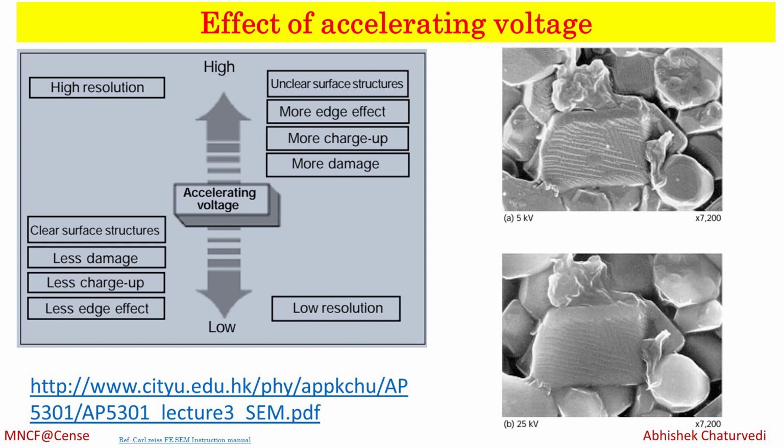Please bear with me, and we are going to discuss the operating parameters of SEM. One of the first parameters is accelerating voltage. Often people ask, my sample is an insulator. The key answer is: don't use high accelerating voltage, because the sample may charge or get damaged.